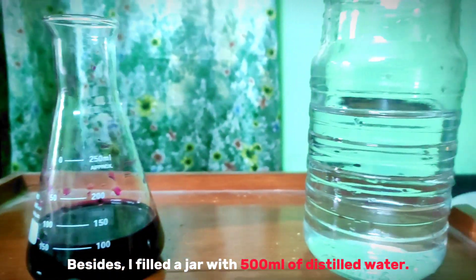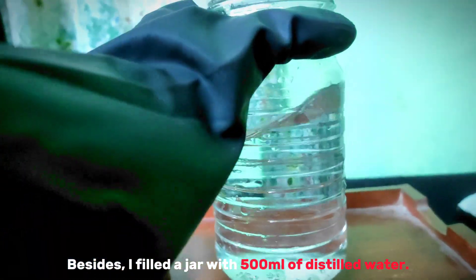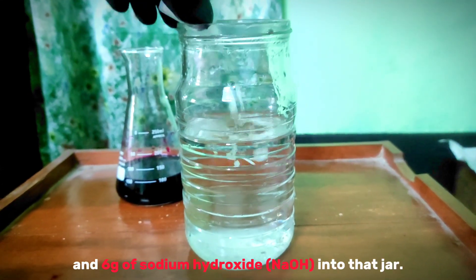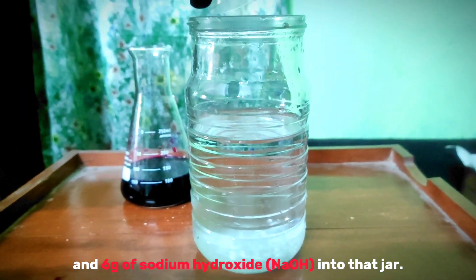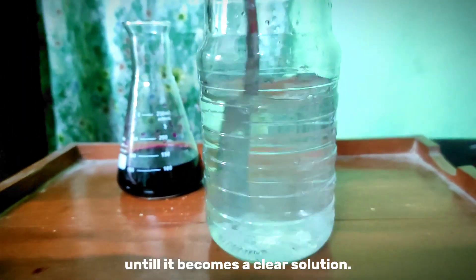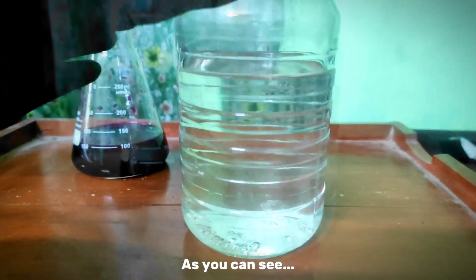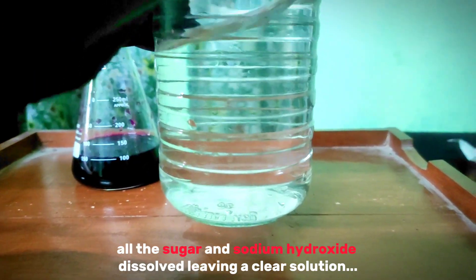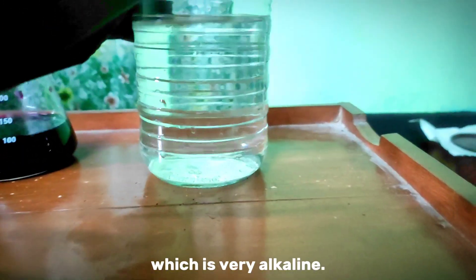Besides, I filled the jar with 500 ml of distilled water. Then I dropped 9 grams of sugar and 6 grams of sodium hydroxide into that jar. I stirred the mixture until it becomes a clear solution. As you can see, all the sugar and sodium hydroxide dissolved, leaving a clear solution which is very alkaline.